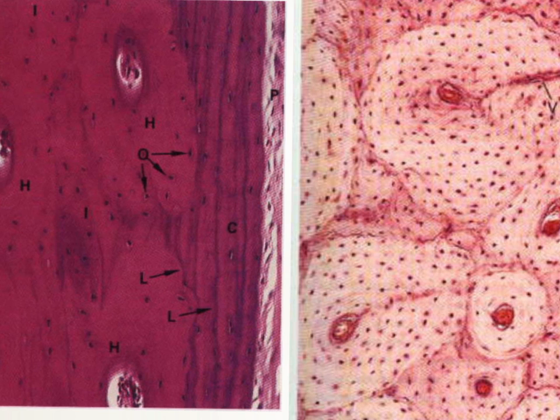This picture on the right side demonstrates the decalcified compact bone as it is stained, and this label here will be the Haversian blood vessels. Why do I say Haversian blood vessels and not Haversian canal? Because the decalcified compact bone section does not contain anything except the living tissues, it does not contain calcified tissue, so you should say Haversian blood vessel.